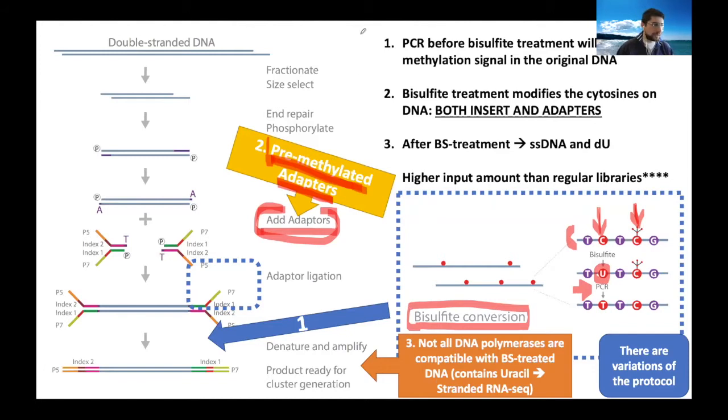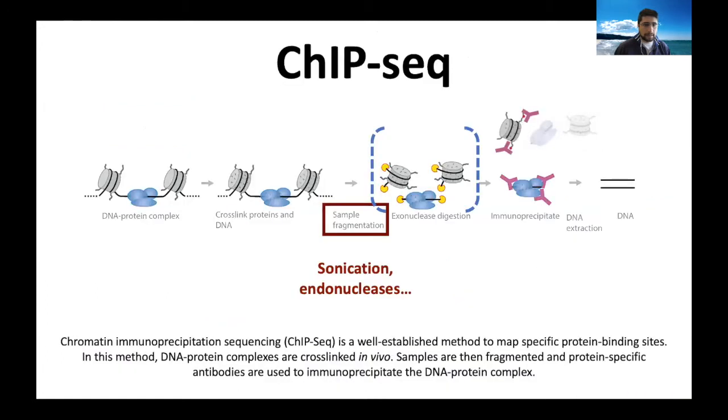Again, this is a very basic DNA methylation protocol. There are many variations of the protocol. So if you're interested, if you have a project with DNA methylation, please talk to me. I can point you in the correct direction, what type of approach to use. All right. Let's go ahead.